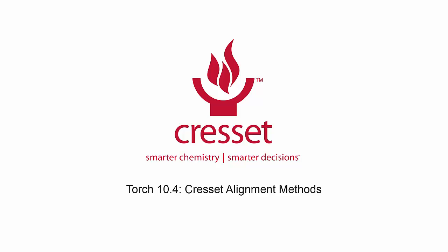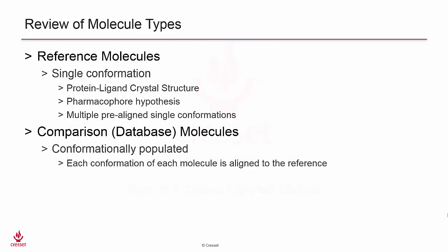In this web clip, we will explore the alignment methods available in the Cresset environment. There are two types of molecules in the Cresset software: reference molecules and comparison or database molecules. The reference molecule is in a preferred conformation or bioactive pose and can come from a variety of sources, including protein-ligand crystal structure, pharmacophore hypotheses, or multiple pre-aligned single conformations. The reference molecule is treated as a single fixed conformation and has the three-dimensional field point pattern that is preferred for activity.